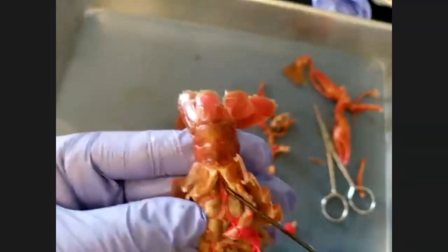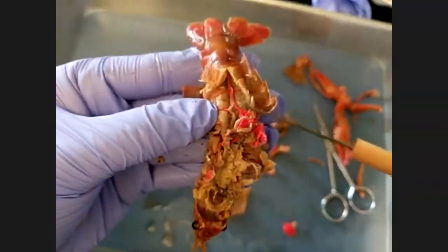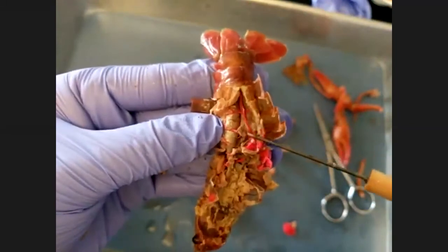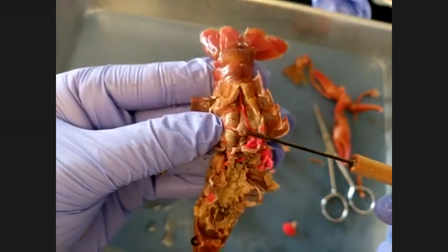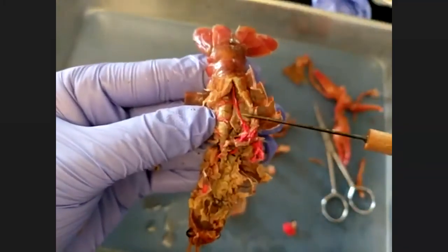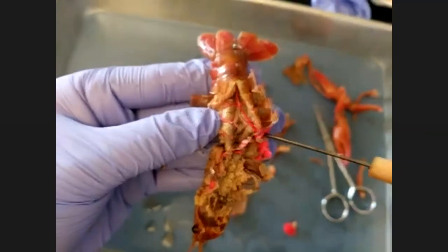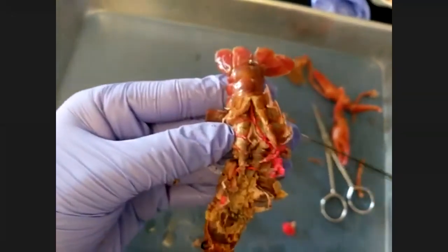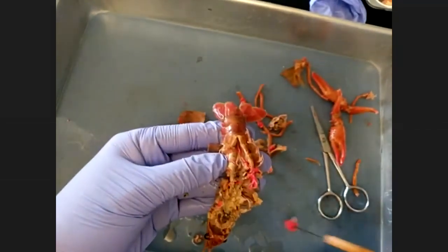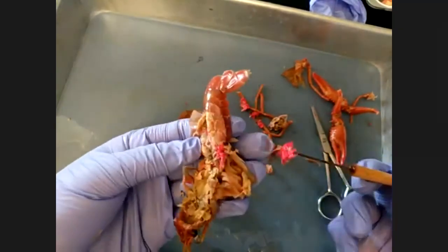Okay, so right through here, you can see where the blood is going to go down into that area. But right underneath it, we also have this tube, kind of. Right here, that is the intestines. So the intestines run down the back end of the tail, right underneath where all the blood is going. The intestines want to be close to the blood because the nutrients come from the intestines. So we want to make sure that our blood comes in contact with that nutrient-rich stuff so air and water can diffuse.